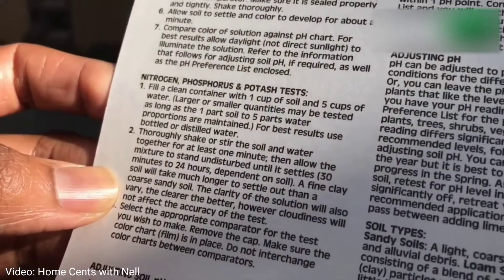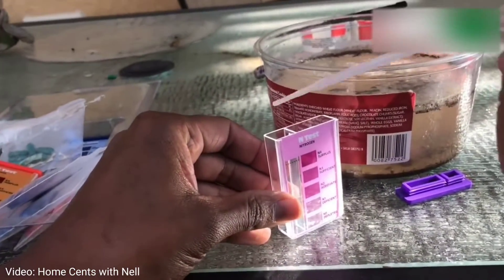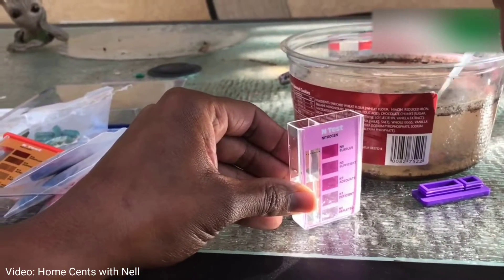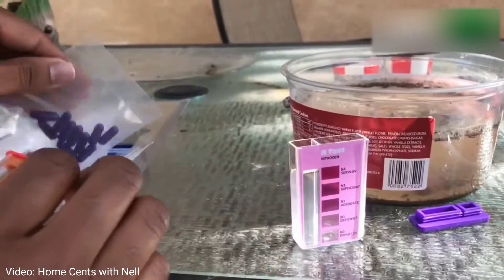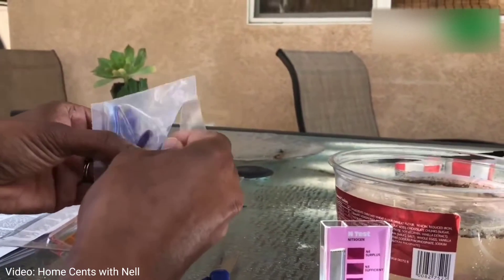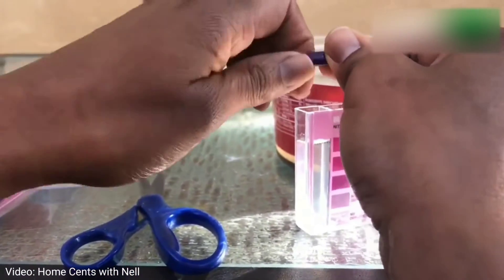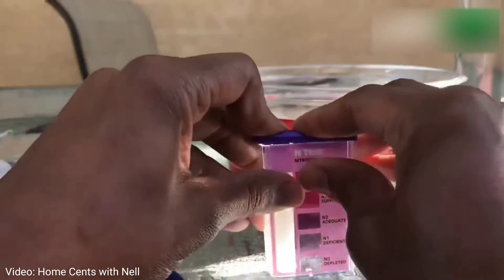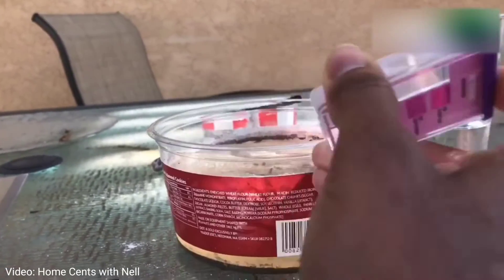Nitrogen is very important in our gardens — nitrogen gives your plants the energy they need to grow and it is a component of chlorophyll. To test our soil for nitrogen, you simply take some of that water that's been sitting and fill up the left side of the comparator tube, then add the contents of the color-coordinating purple capsule into that water. After you add the water and the capsule, you go ahead and shake it, and then you need to let it sit for about 10 minutes before you read it.